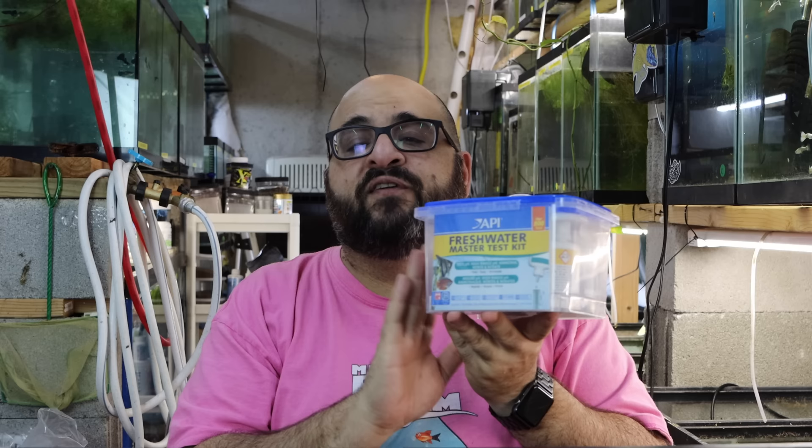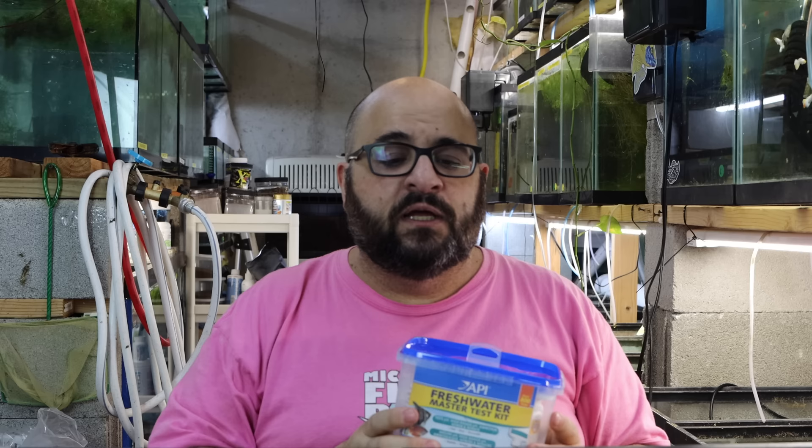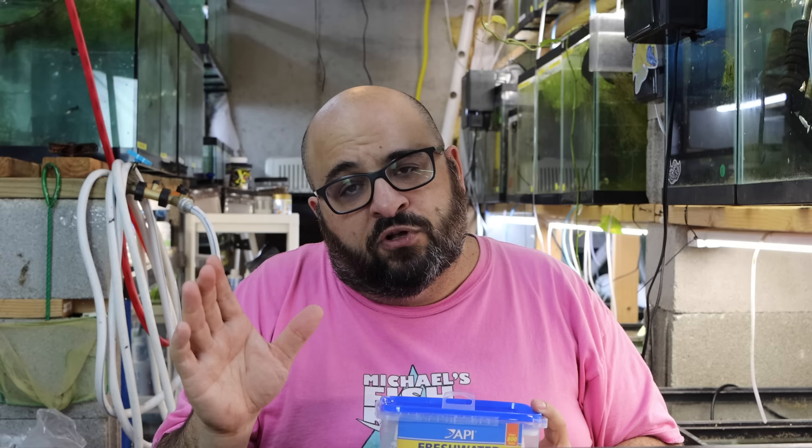This kit is sort of the gold standard, at least in America, for testing water. It's relatively inexpensive — about $20 on Amazon, I'll put a link down below. At a local fish store it's probably a little more, maybe $25 or $30. If you can, you should support your local fish store. If you're in a rural area or there are no local fish stores, you can buy it off Amazon — I do make a couple shekels as it is an Amazon affiliate link.